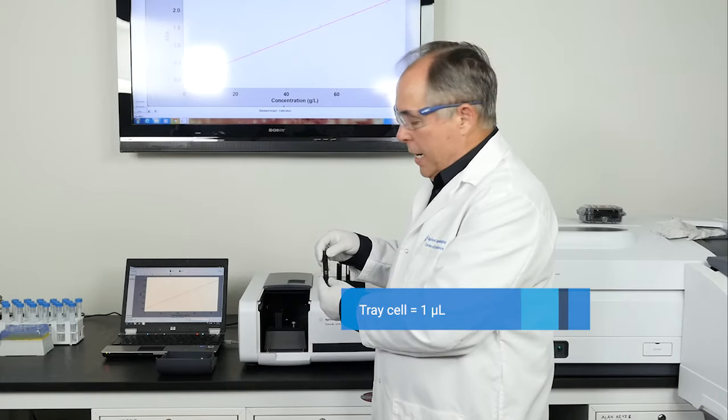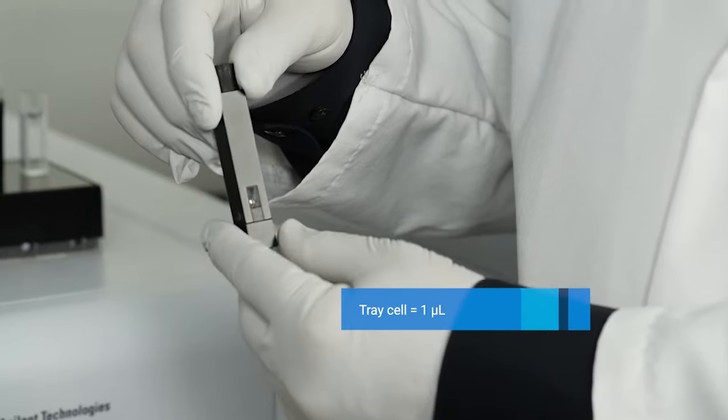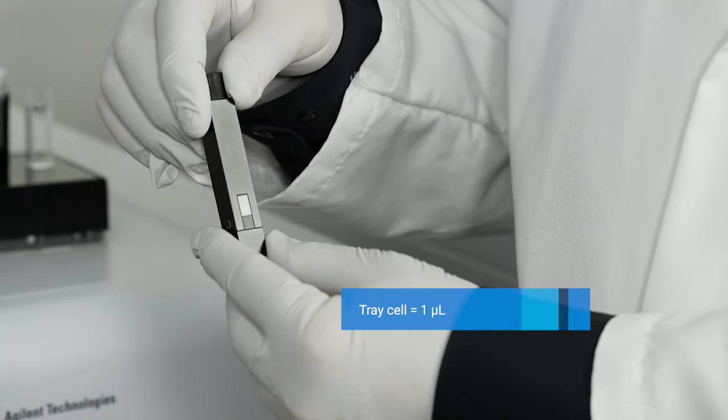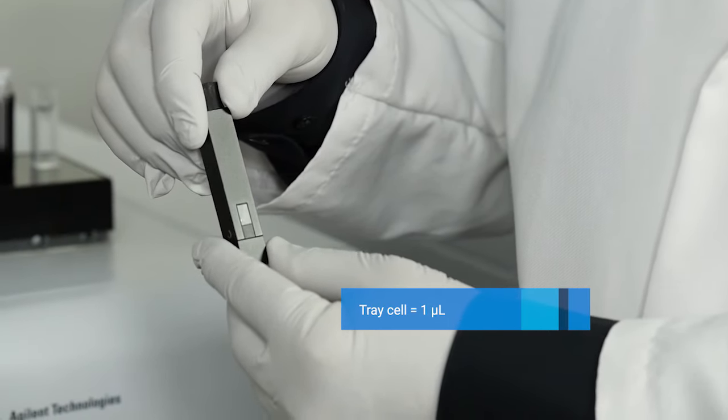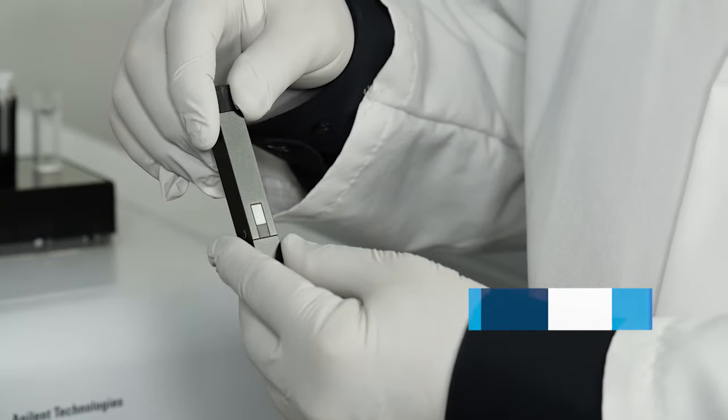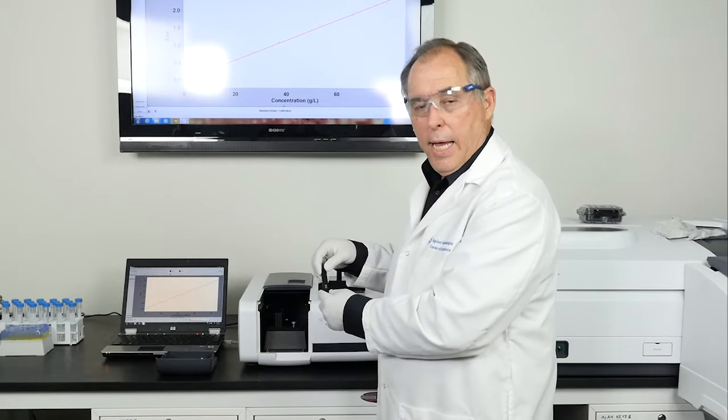The fourth cell type I'm going to measure is called a tray cell that measures one microliter sample and can determine both the concentration and the purity of the nucleic acid if that's what you're measuring. So we'll place it in the sample compartment and see how much energy we can get through with this arrangement.